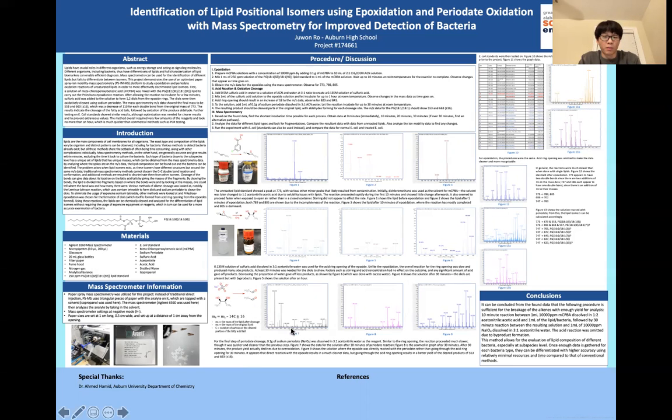Anyway, the last step, periodate oxidation. I used sodium periodate, which again was chosen because it is a relatively stable salt at room temperature. I mixed 0.1 grams of it with a 3-to-1 ratio of acetonitrile and water to create a 10,000 ppm solution of it. So I added 1 milliliter again of this periodate solution to the initial diol solution, and then later on I omitted that step and added it to the epoxide solution directly.